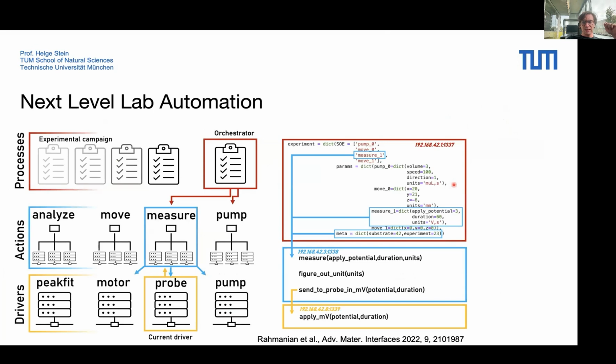And the idea here is that we break down the programming of a laboratory instrument. We are right now trying to program some of the new instruments, and this is always a big pain. But essentially, once you have written those drivers, you want to have this so abstracted that the code that I'm showing here becomes a valid experiment.